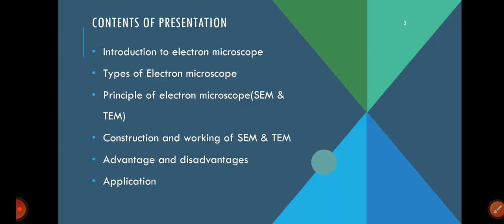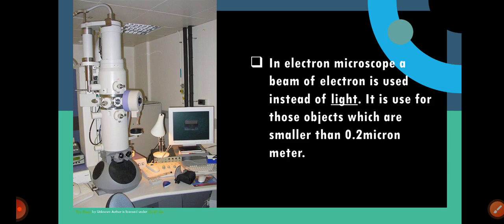The topics that we are covering in this video are: introduction to the electron microscope, the types of electron microscope, the principle of the electron microscope, construction and working of the electron microscope, advantages and disadvantages of the electron microscope, and its applications.